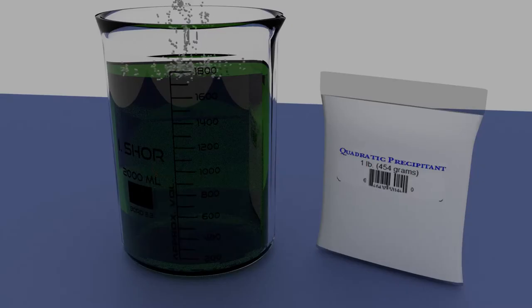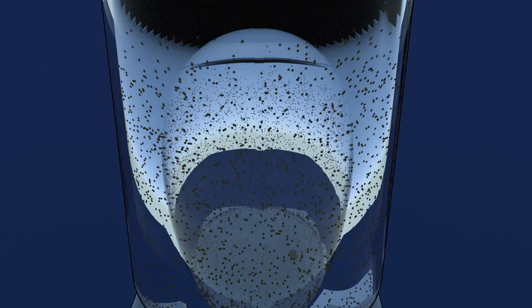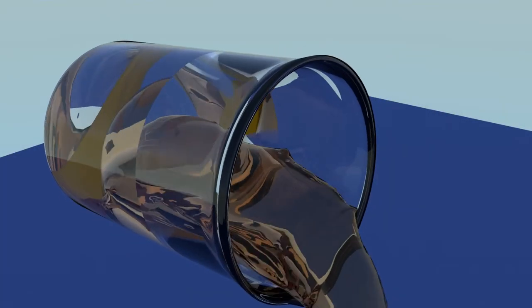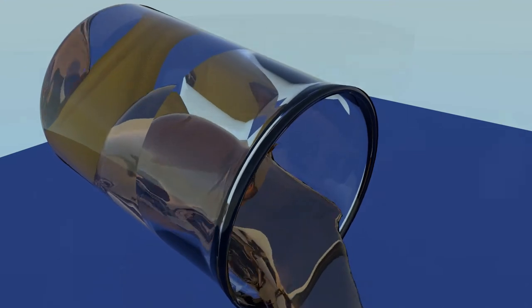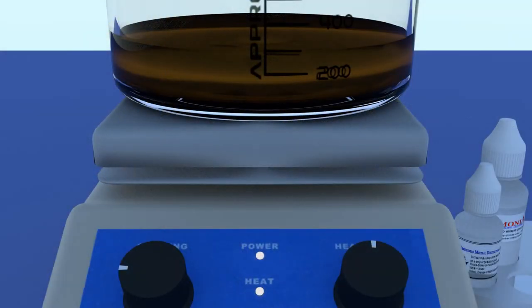After the metal has dissolved, a selective precipitant is added, converting the gold content back into solids in the form of heavy particles. The other metals remain dissolved. The solution is then decanted to recover the gold mud. The mud is dried and then melted.